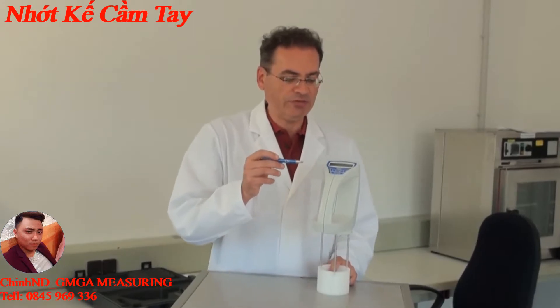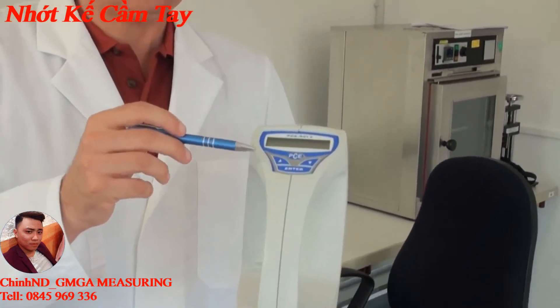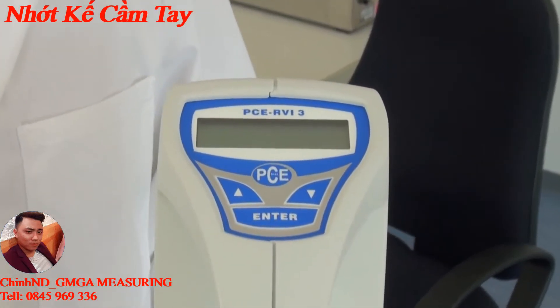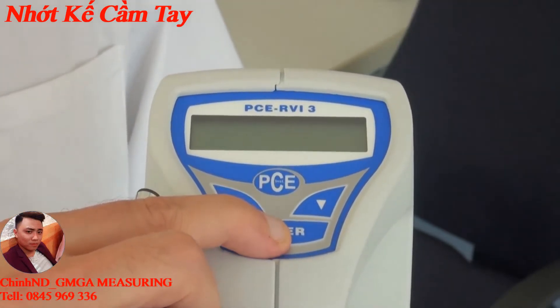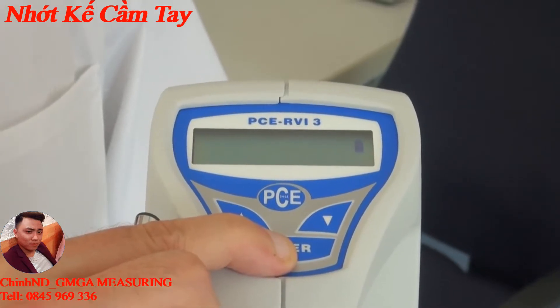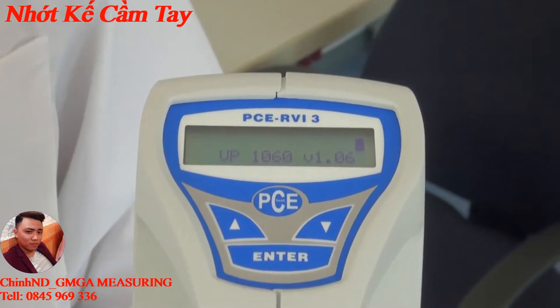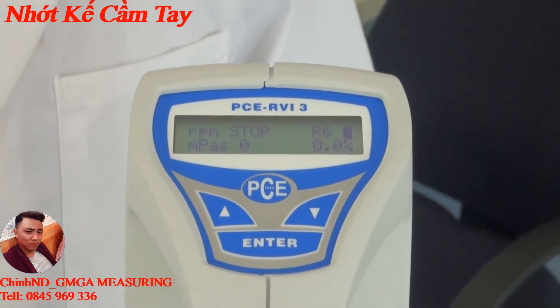The measuring device has on the top an operating panel and a display to show the measured value. The operating panel consists of only three keys and is easy to use. To turn the device on, the enter key is held for about 10 seconds. The measuring device then boots up and the measuring area is shown.